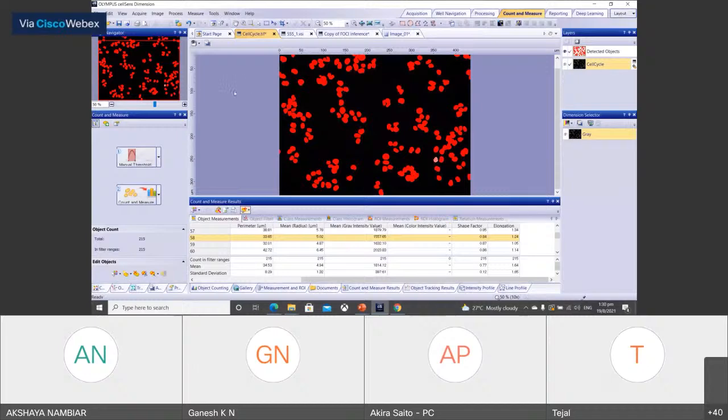So I will just go back to the software. I'll just simply show how our neural network deep learning segmentation works. Actually, I cannot show the entire process because the training takes a very long time and also requires a very good GPU, and I don't have one. It's my laptop here, so I cannot do it.